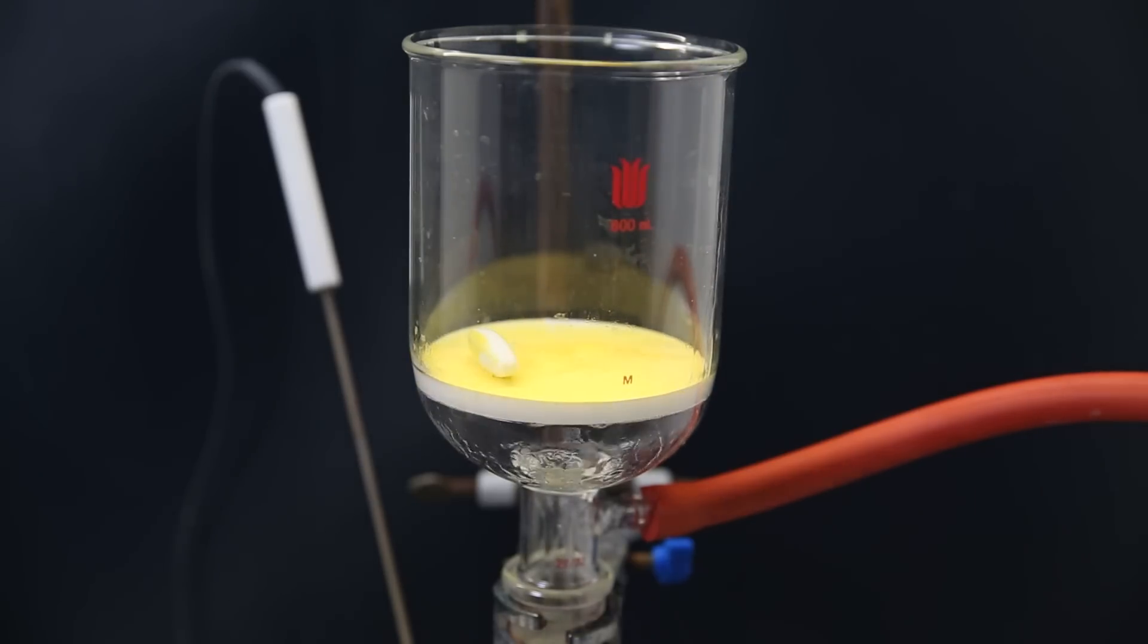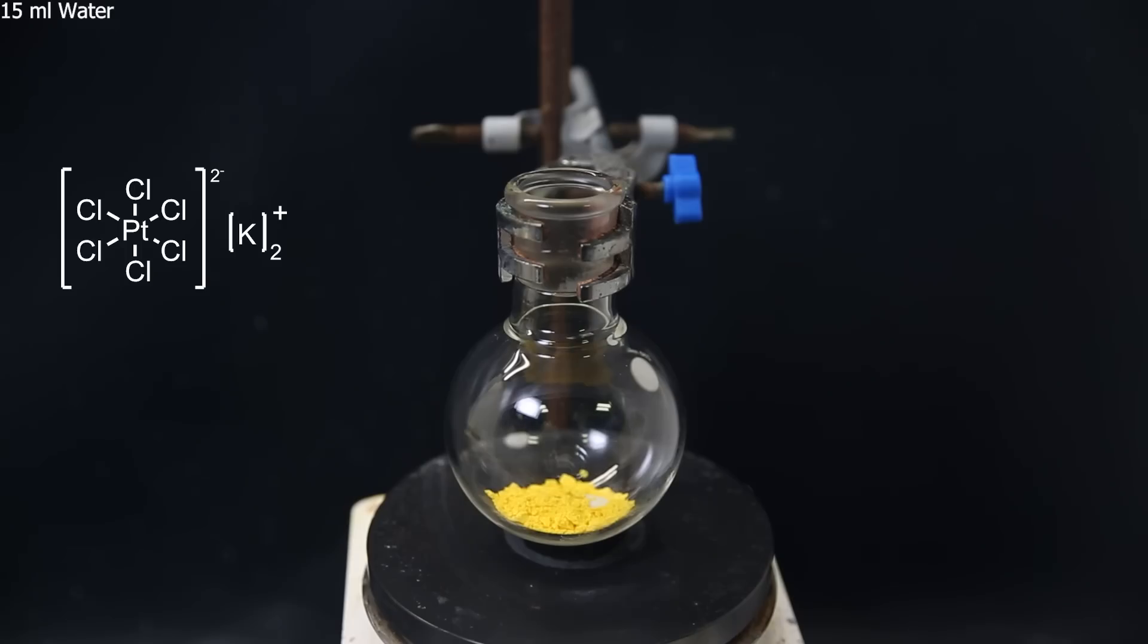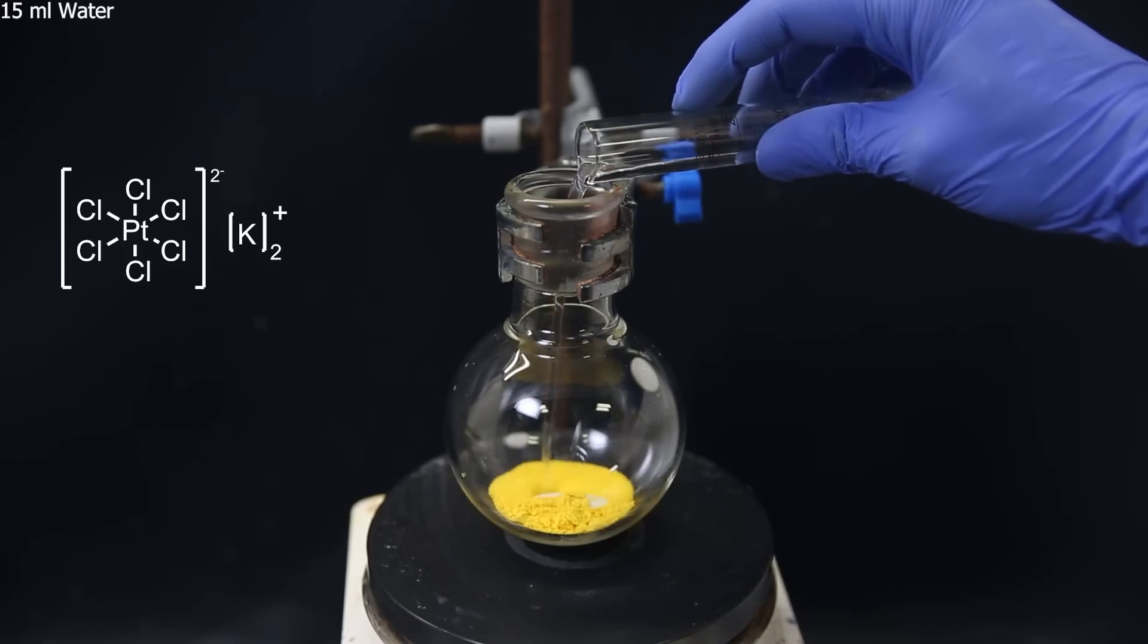I left it to dry on the filter for a while, and then scrape it all off and transfer it all to a flask. I then add 15 mils of water to suspend the potassium hexachloroplatinate and set it aside for a second.